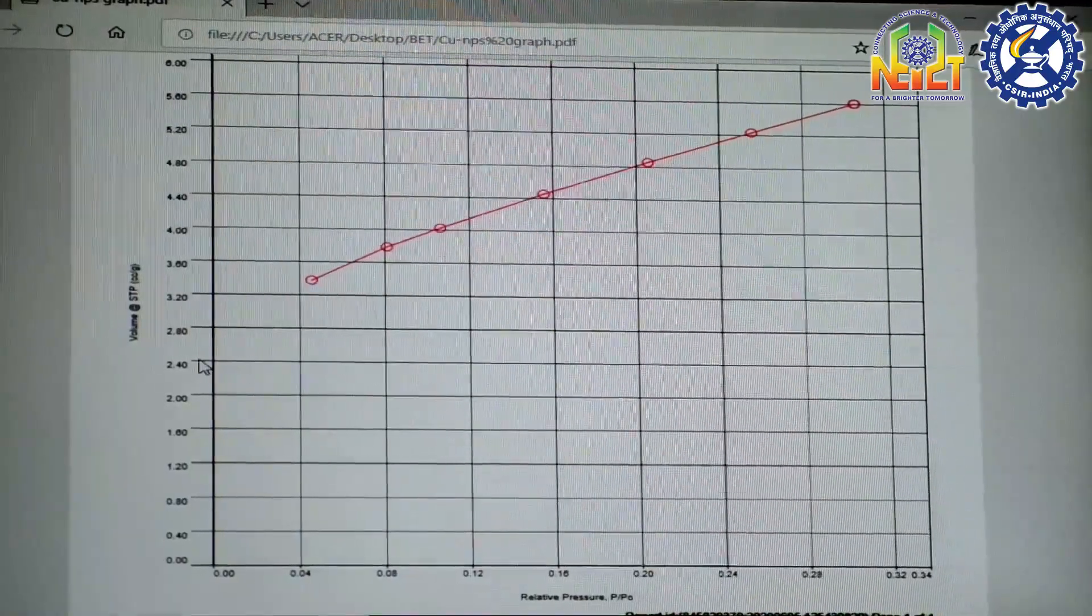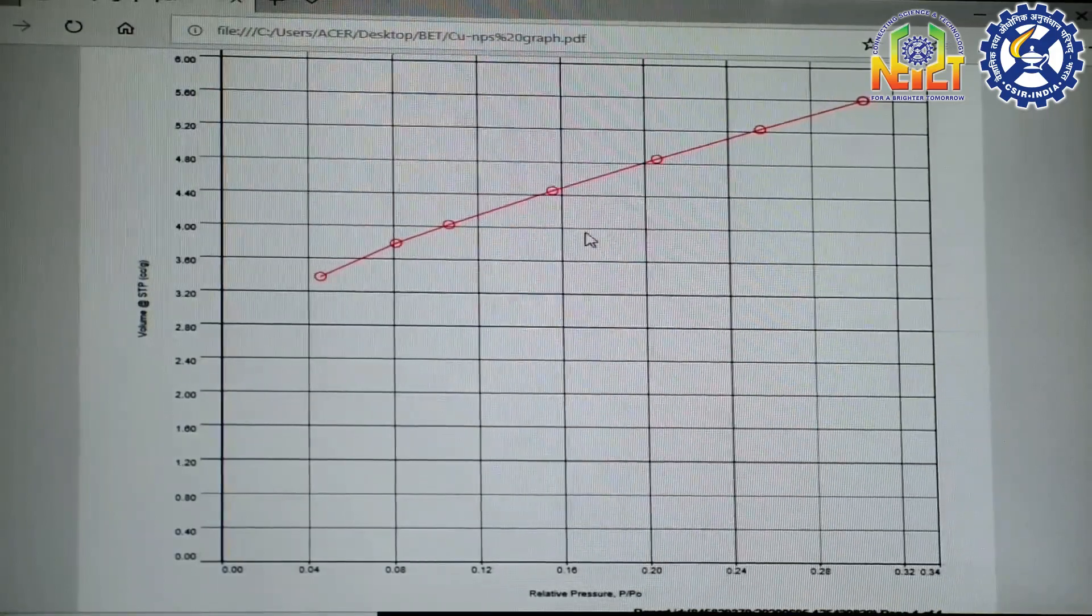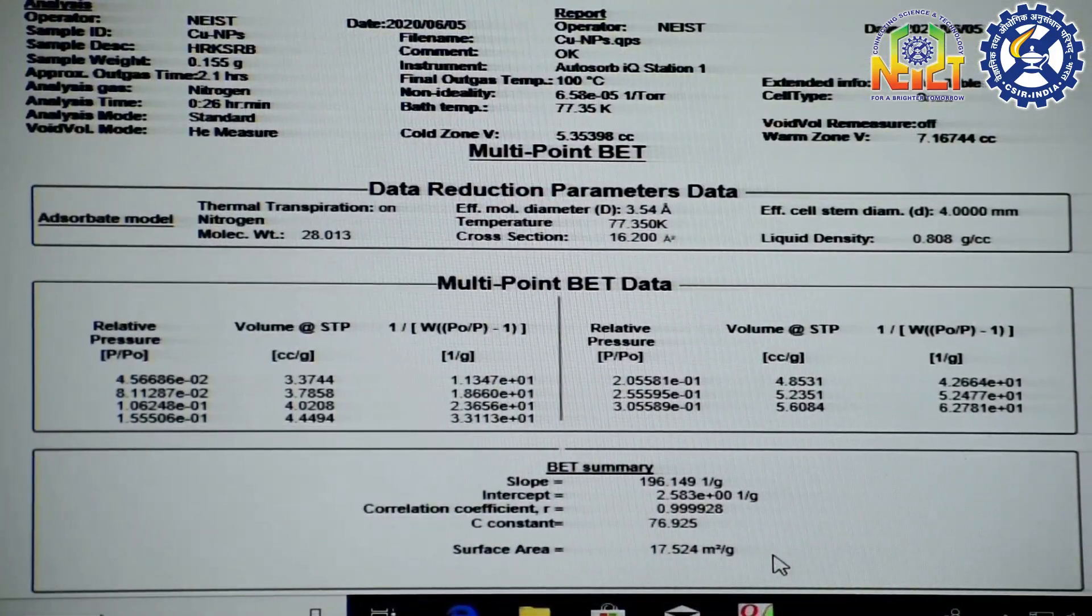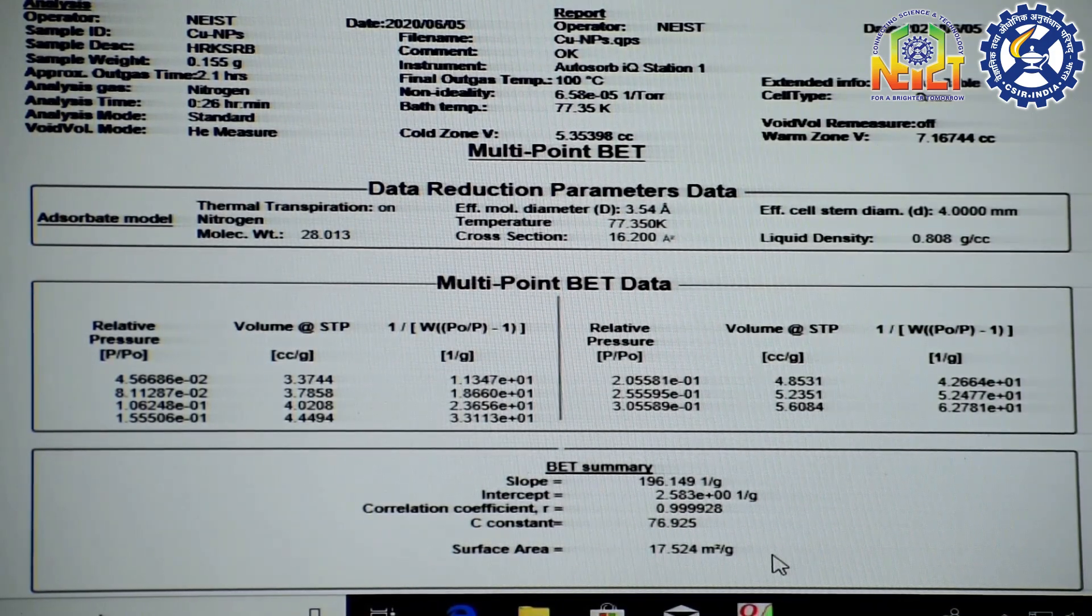And it is the volume versus relative pressure graph. We have taken 7 point BET for measuring surface area. And these are the multi point BET results. We have to find the slope and intercept from the graph to measure the surface area.